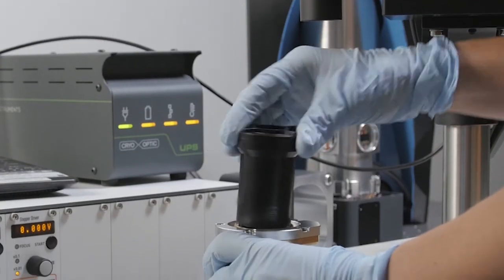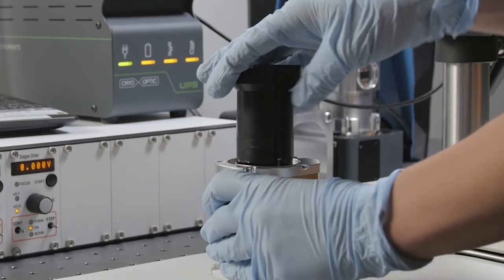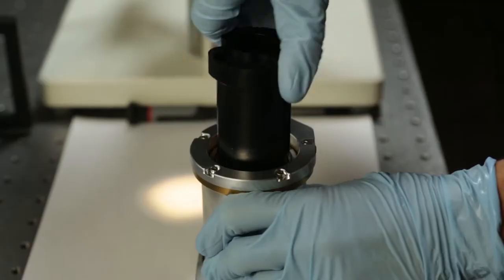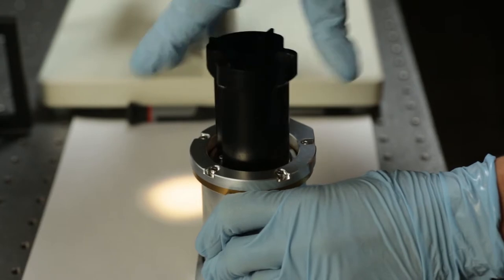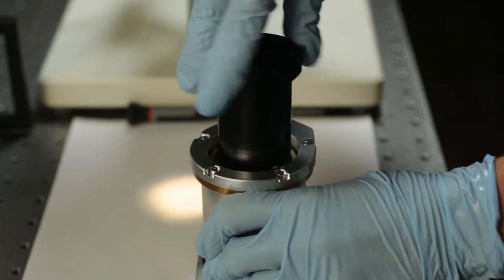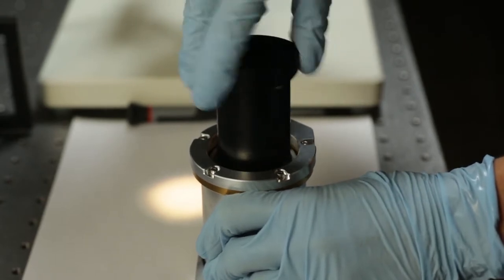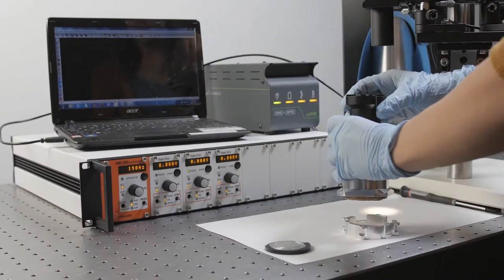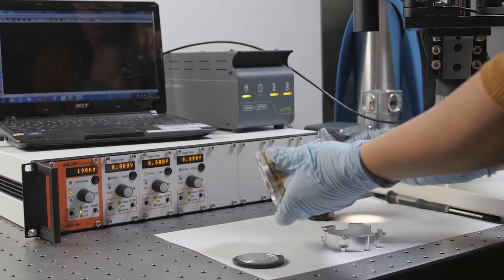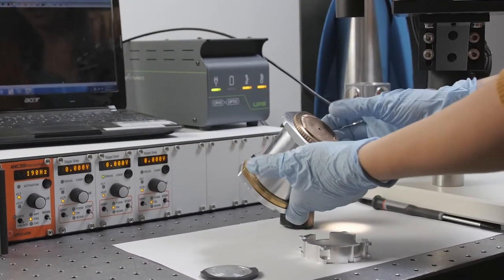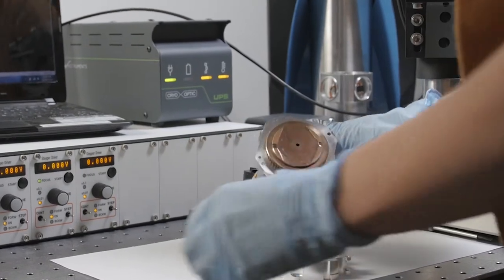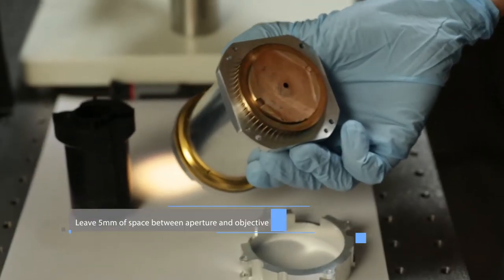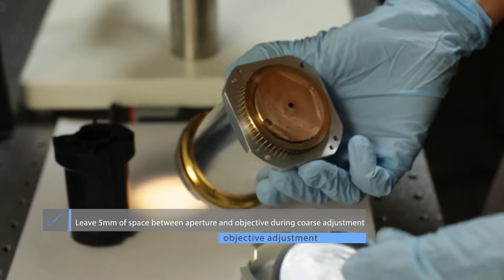We'll start to coarsely adjust it by just twisting down. If the threads ever catch, you want to back off so you don't get it stuck. I'm checking to make sure that the aperture and objective don't crash. And once they're close enough, I can do the fine adjustment with this reference disc.